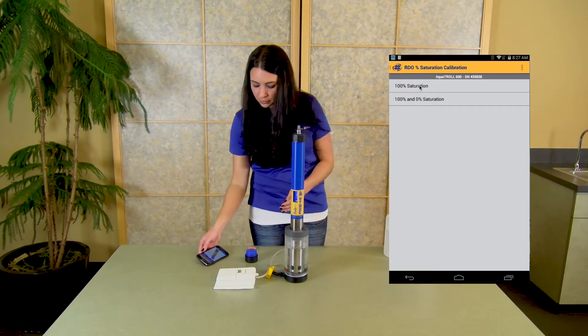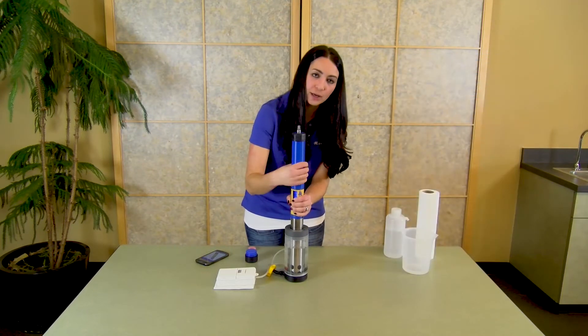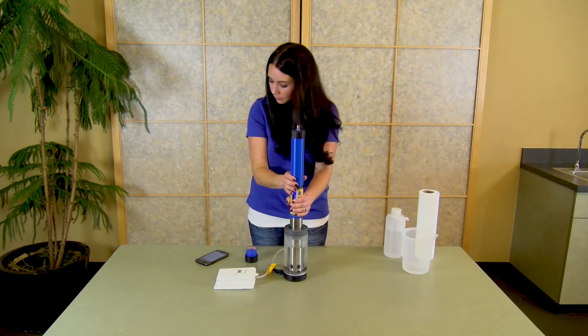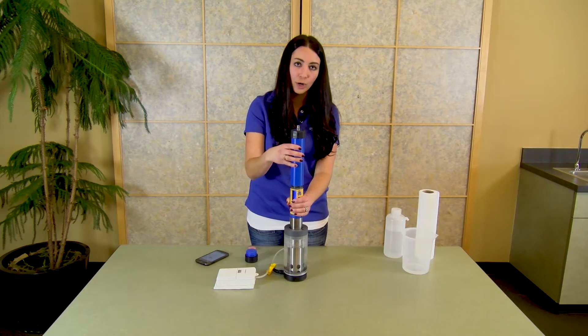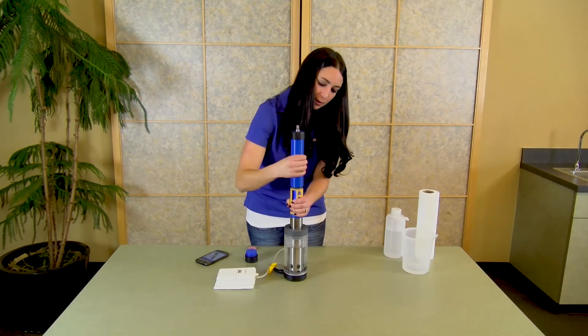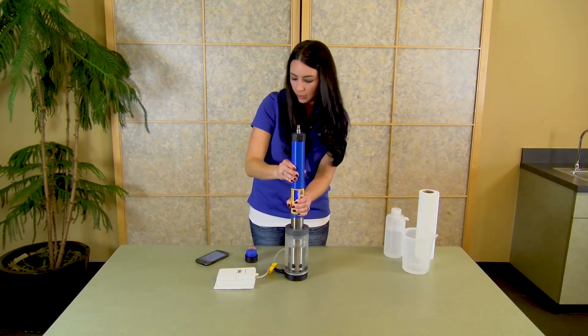For non-vented instruments, it's important that you get an updated barometric pressure reading. To do that, you will unscrew the back end of your instrument — this allows the instrument to update the internal barometric pressure sensor. Once complete, close that back down and then continue on with your calibration.